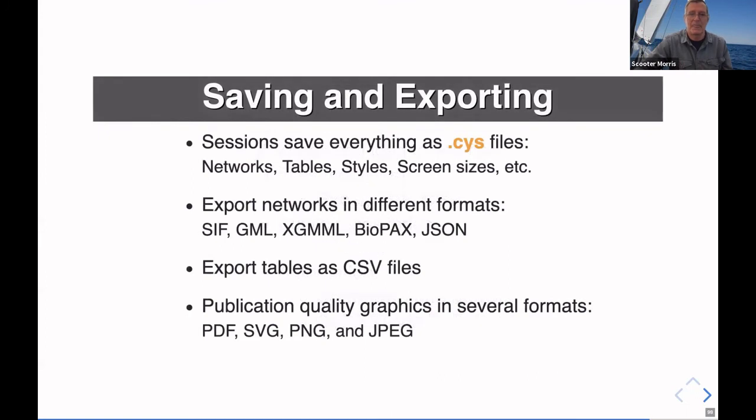In Cytoscape, when you do a save, you're saving a session file. So when you do an open, you're opening a session file, and a session file just contains everything. It contains screen sizes, styles, tables, networks. In some apps that I've worked on, I actually write PDB files into the session file so I can remember it. Images will go in the session file, depends on really the app that you're working on. I worked on a single cell RNA-seq analysis app in Cytoscape, and we saved the single cell data in the session file so that you don't have to reload it. All sorts of different approaches.